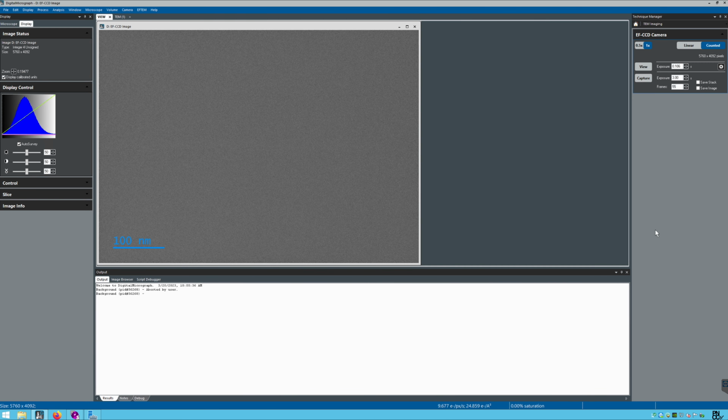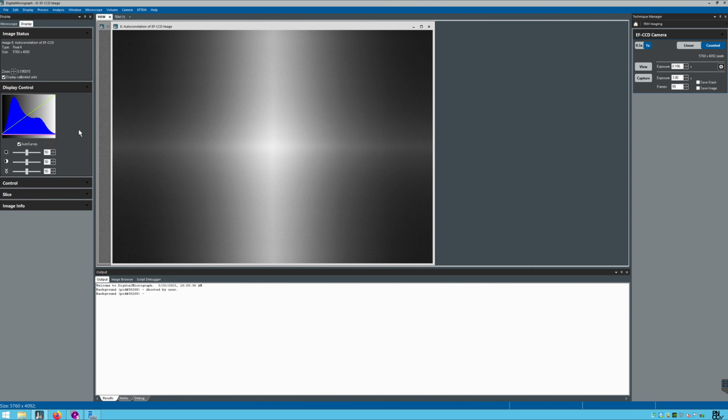Okay, so about 10, autocorrelation. Yeah, and now you see some banding. So this is one example. This is because it was an underdosed image. So remember, we need to create a good exposure image. This may be a reason that you would check this at the end before your collection starts, once you have your record beam set up.